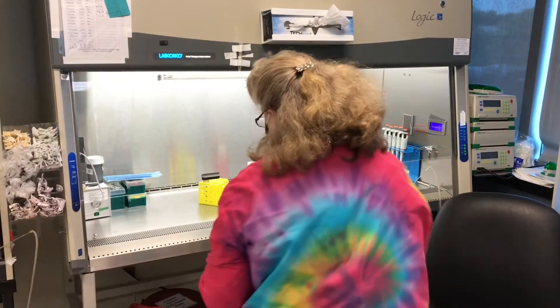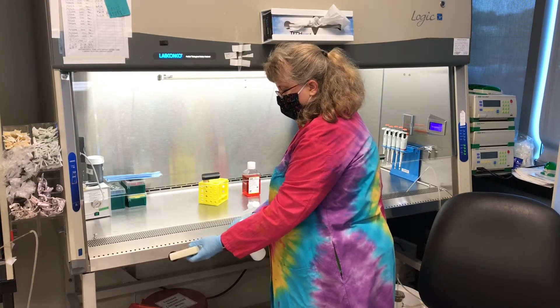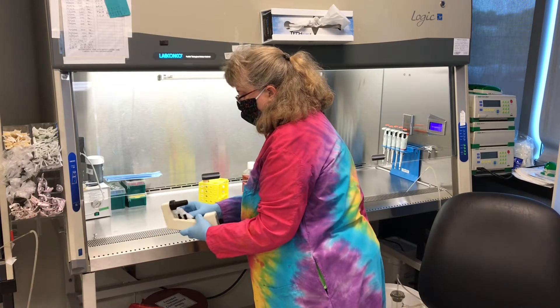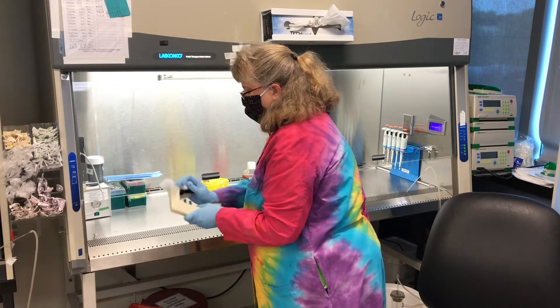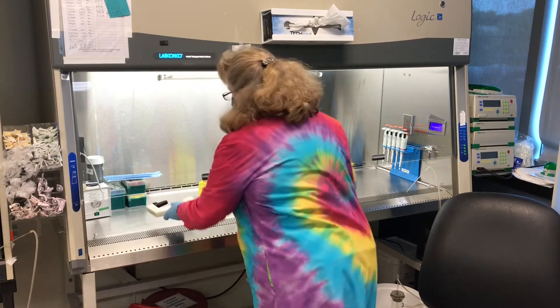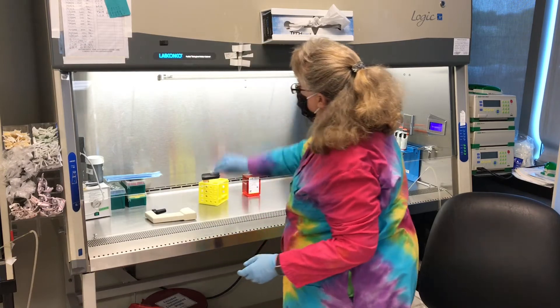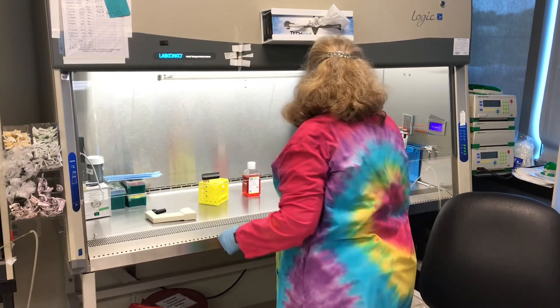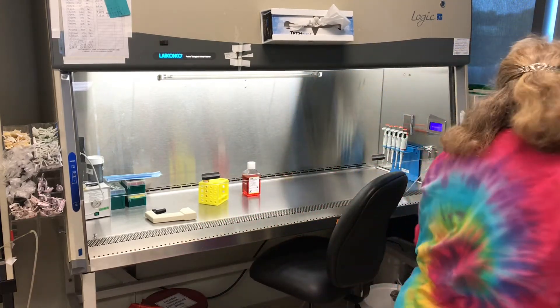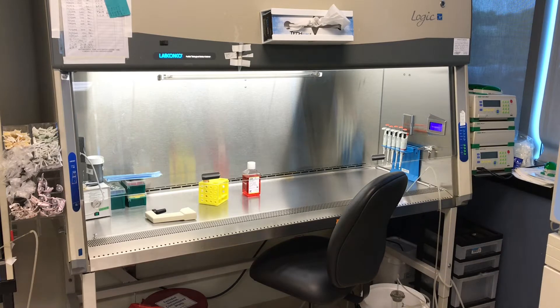I spray the pipette aid down too, because a lot of people use it for a large variety of applications and I want to make sure everything is as clean as possible in the hood. And here's where my little OCD comes in — I don't like other people's face smudge on the face glass, so I always wipe down the outside of the glass too.